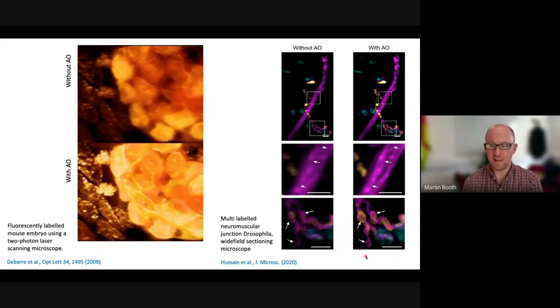So, and you can see in this case that we've also been able to use image-based methods to correct and reveal much more details in these areas of these specimens here than was present before we corrected the specimen-induced aberrations.